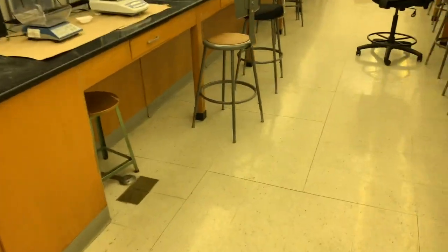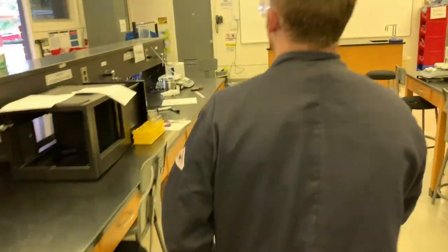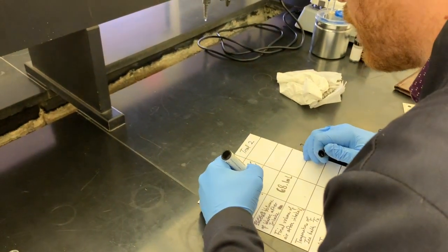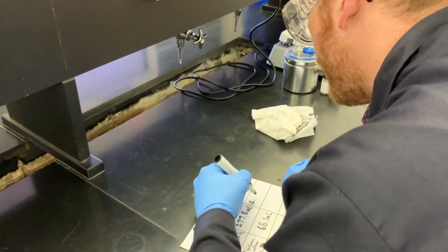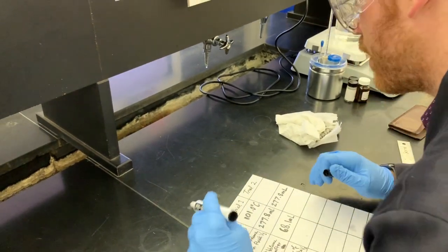So we're gonna go over here and put this on our sheet before we forget, or rather, that's the kind of thing I would forget. We can put it for both of them. So 277.8 milliliters and 277.8 milliliters.